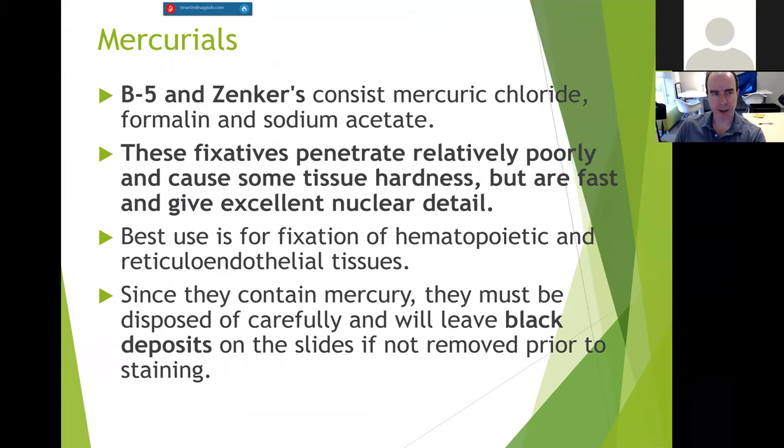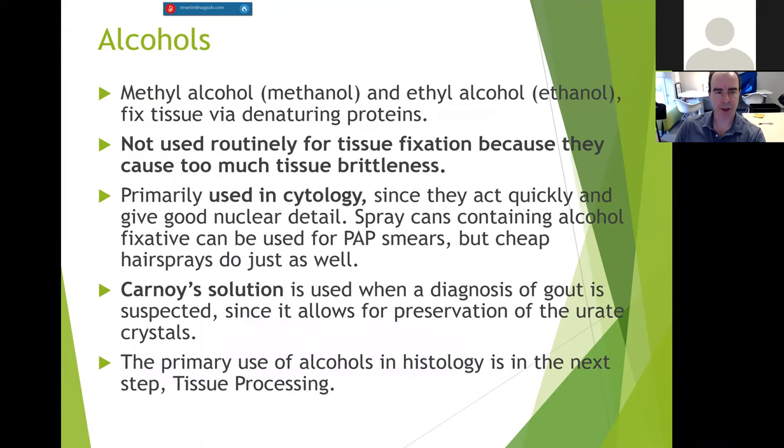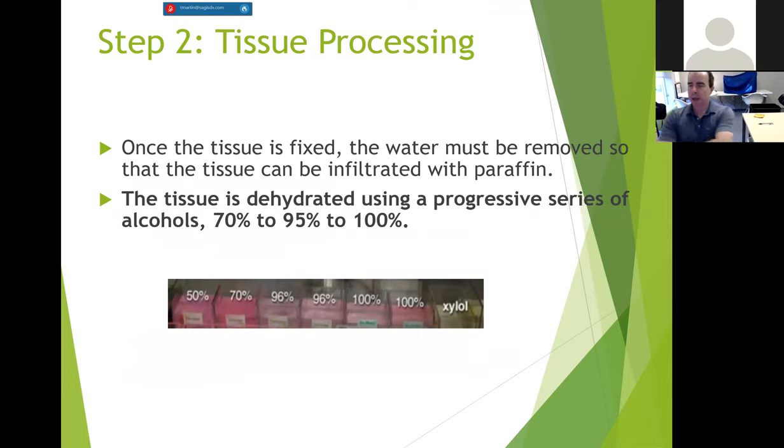Glutaraldehyde, we're not going to talk about that. We're just going to skip through some of this because it's not relevant and it's not going to be on your board. So the second step is, after we've received it and we've grossed it, it goes through tissue processing.